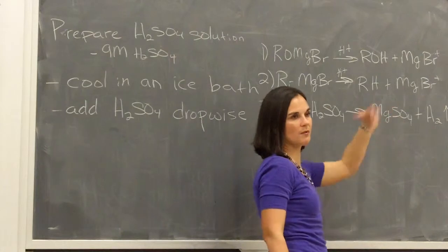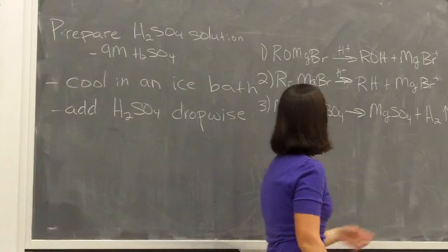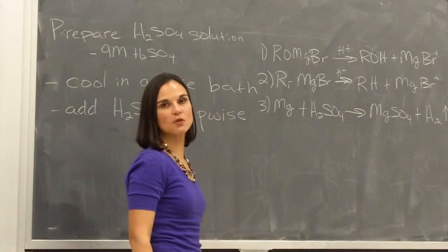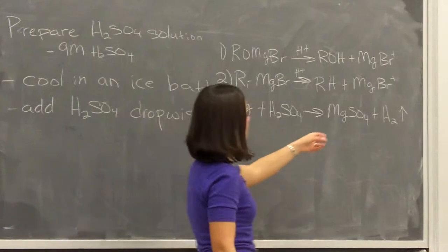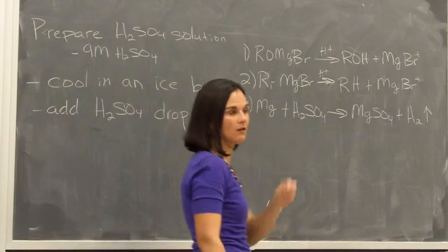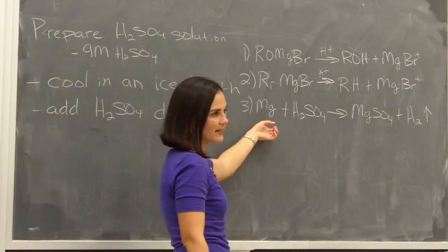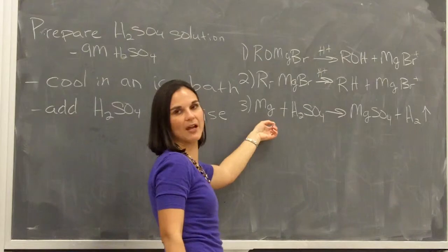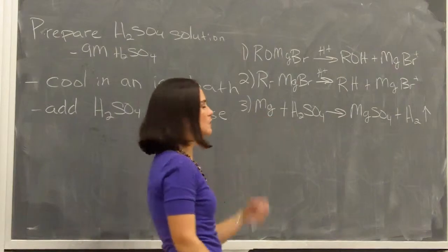If you don't dissolve the solid when you put it in your separatory funnel, it's going to clog the separatory funnel, okay? The other thing is after all your sulfuric acid has reacted, if you still have magnesium floating around that never reacted, as you pour this solution into your separatory funnel, we'll want to pour it through some glass wool in a funnel to trap that magnesium. If you have remaining magnesium, or you're concerned about whether your magnesium is done reacting or not, let us know. We'll take a look. A lot of times it does take a little bit for that magnesium to react.